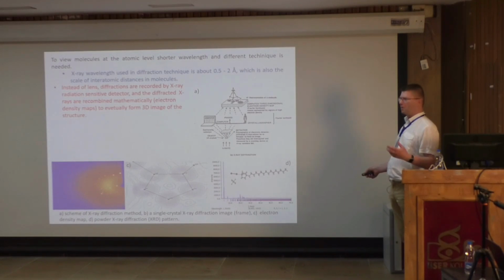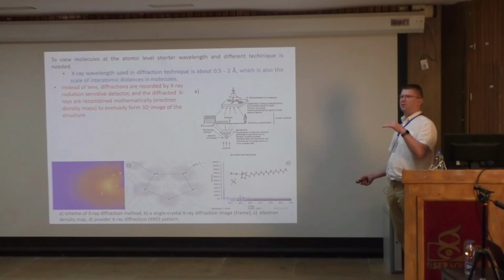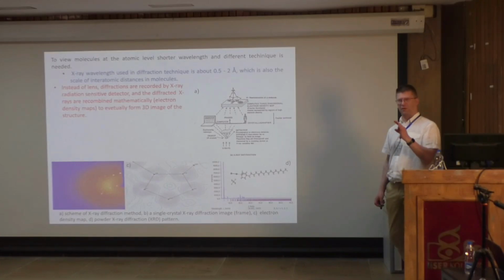Later on you will see where this comes from and why it's needed. Because each individual thing is a single part of the whole information. So the information about how the atoms are organized in this crystal is here inside this diffraction pattern. But each of these individual tiny points contains a tiny fraction of information.